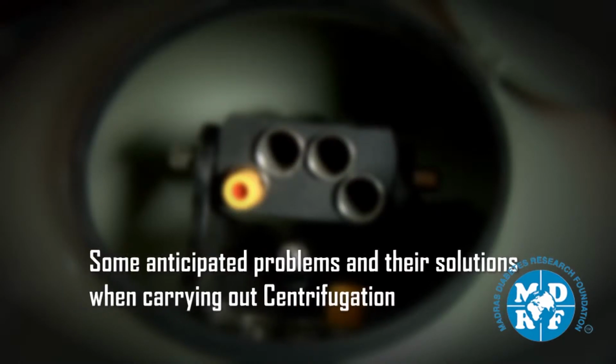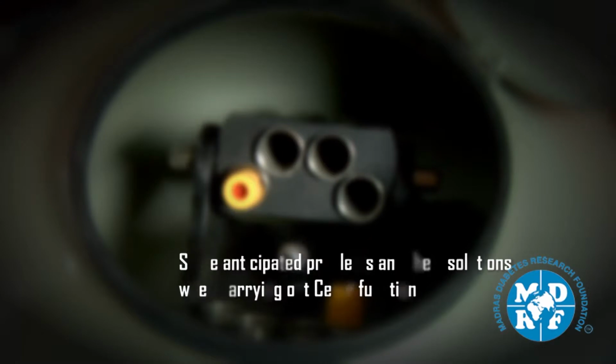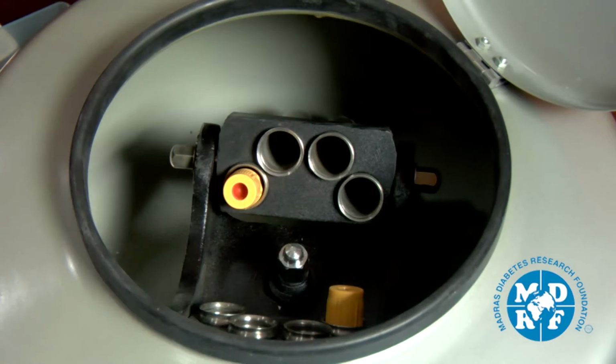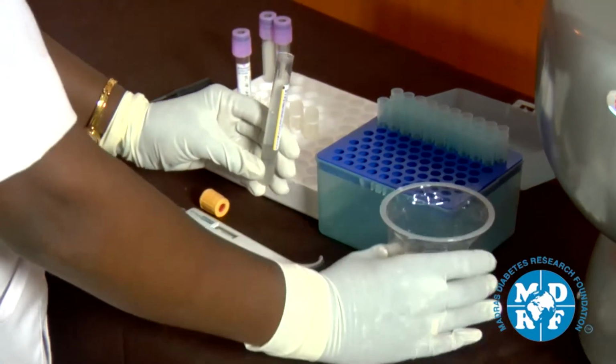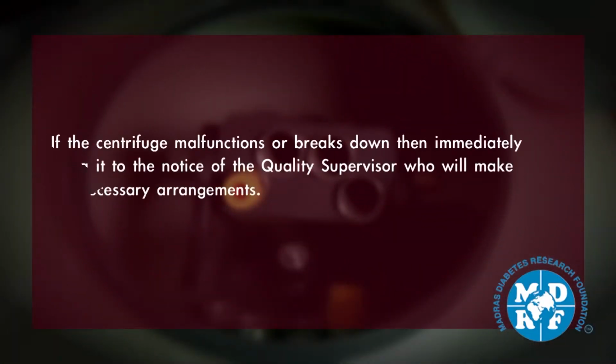Some anticipated problems and their solutions when carrying out centrifugation. If the vacutainers break due to improper loading of the centrifuge, then the centrifuge load must be diagonally balanced by placing vacutainers containing an equal volume of water opposite to each other. If the centrifuge malfunctions or breaks down, then immediately bring it to the notice of the quality supervisor, who will make the necessary arrangements.